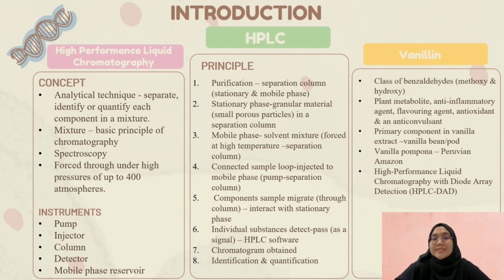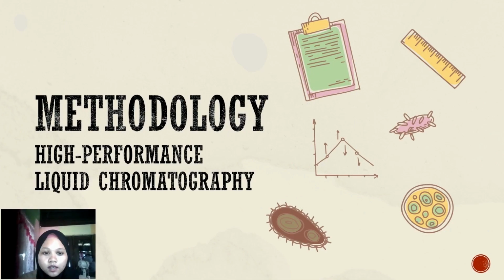In this experiment, the method is focusing on the analysis of wild Vanilla pompona ssp. grandiflora fruits from the Peruvian Amazon, and the quantification process was done by high-performance liquid chromatography paired with a diode array detector, HPLC-DAD. Next, I will continue with the methodology part.